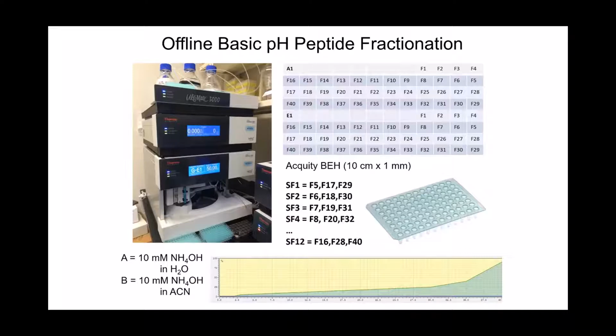Have you used it for PTM analysis too? We haven't done that yet, but that is something that we were looking at. So we've got a histone project where we've done our traditional histone PTM, but then we also want to do that with the DIA approach. So we may have that soon. Great, thank you. Yep.